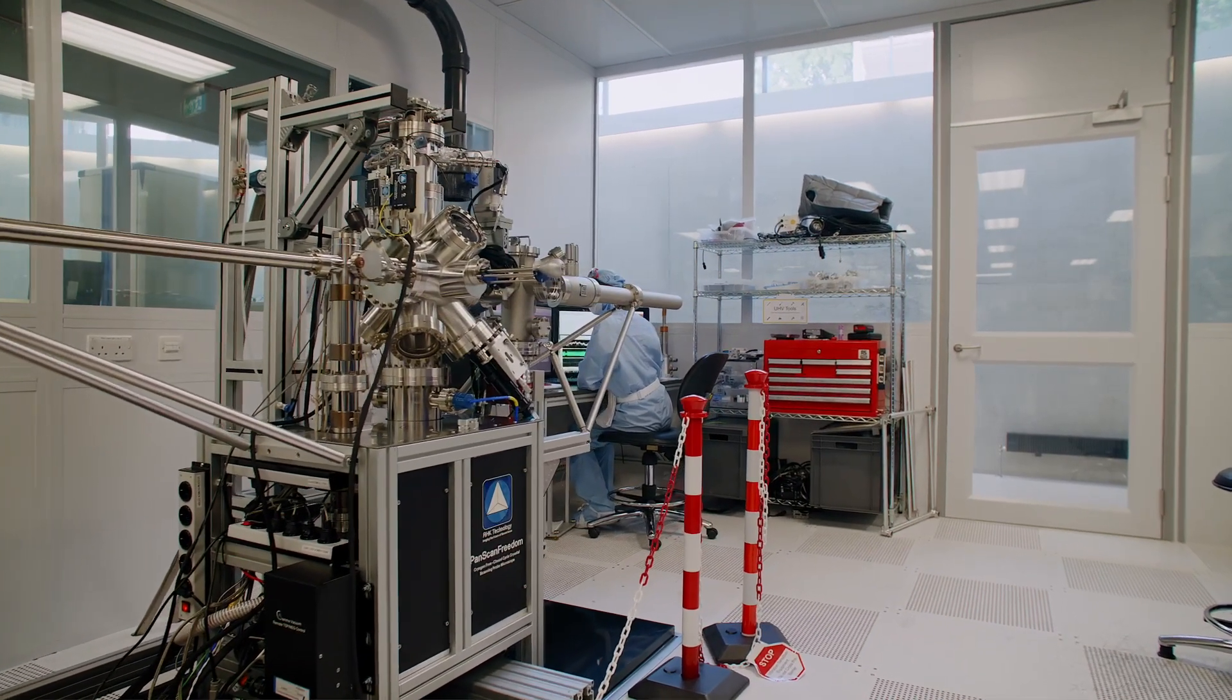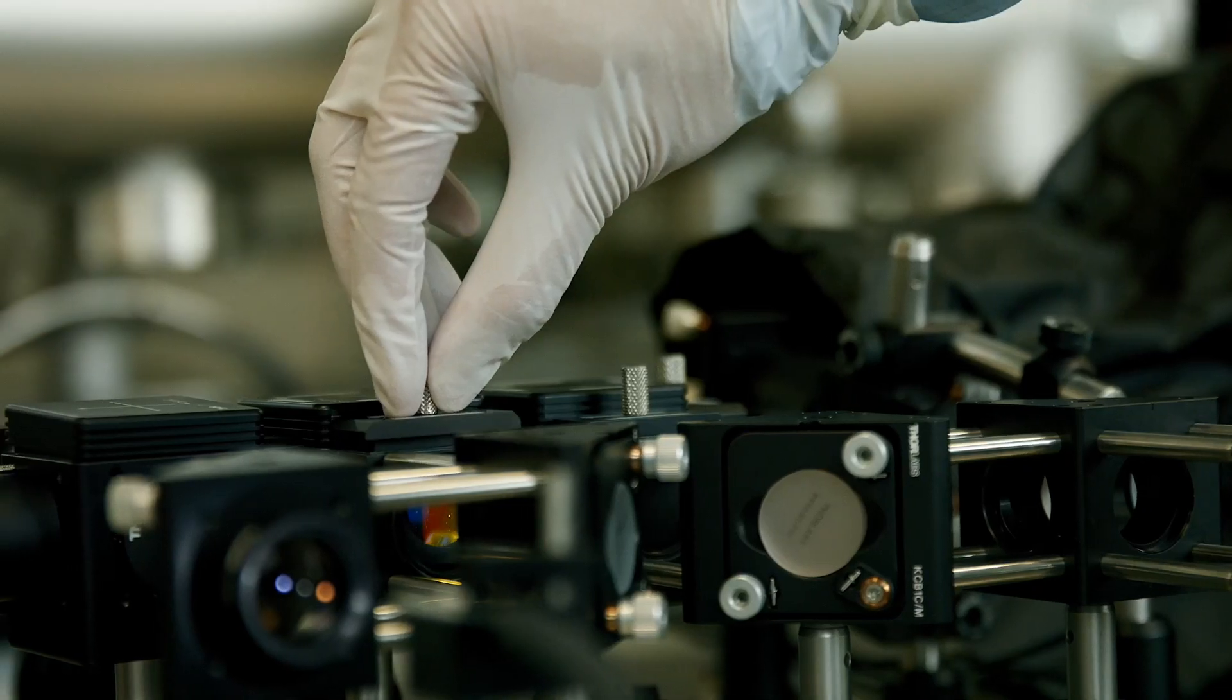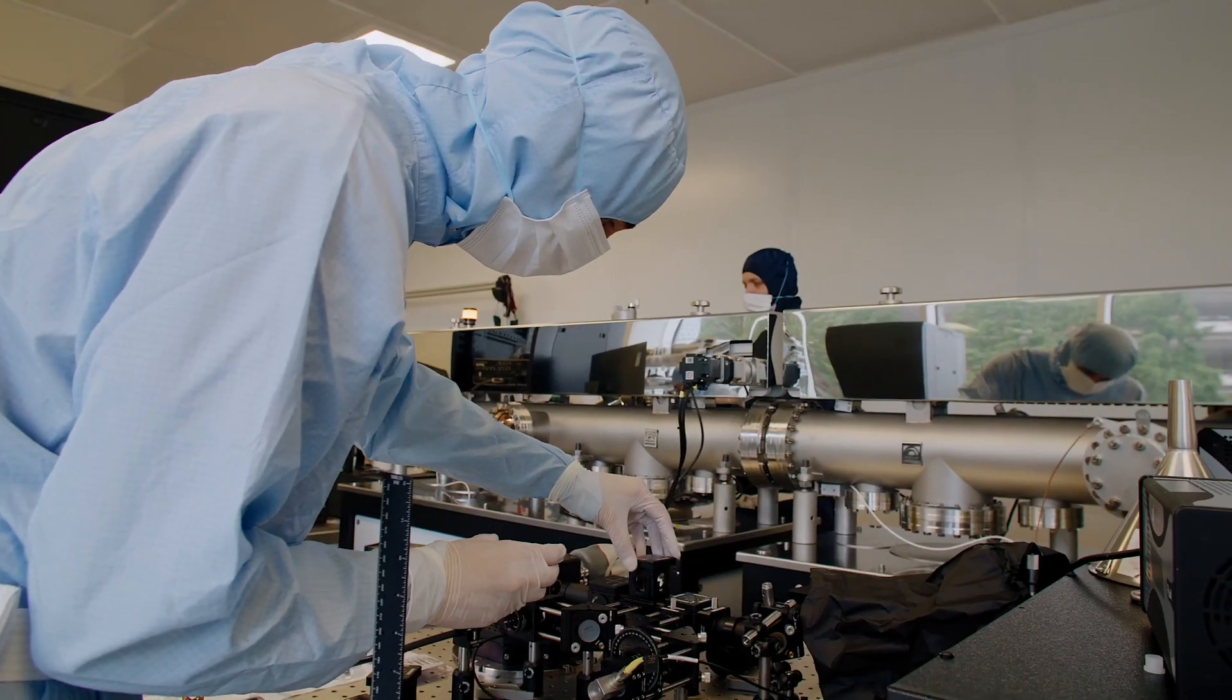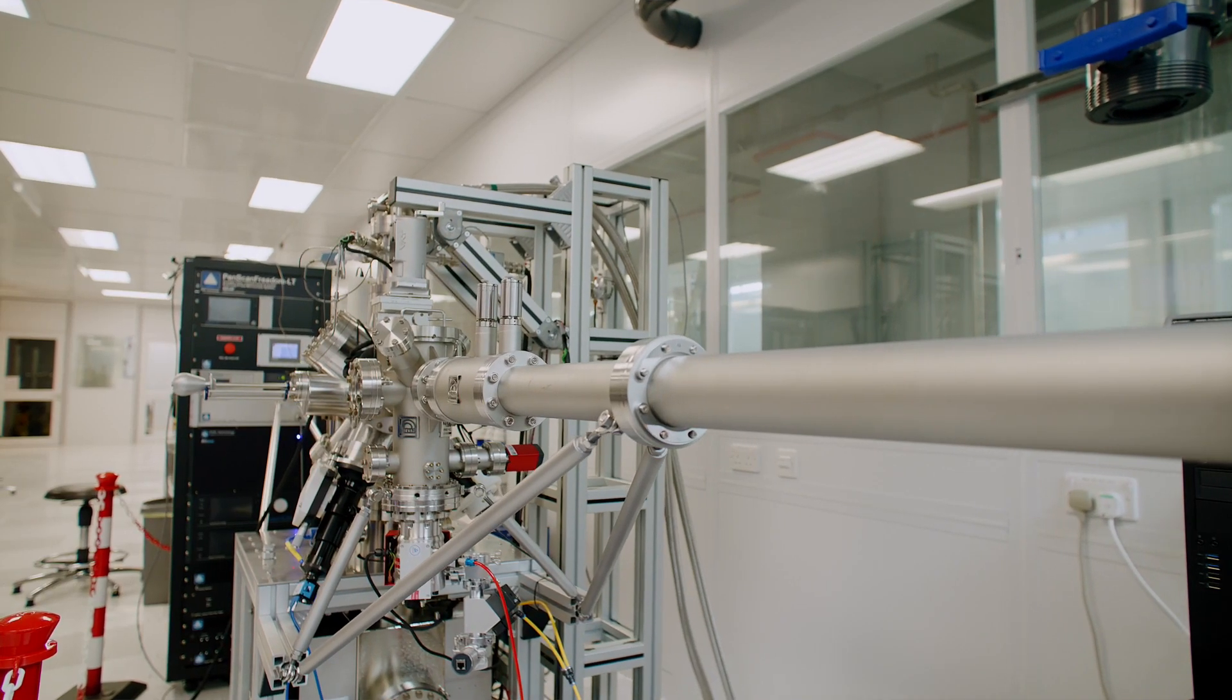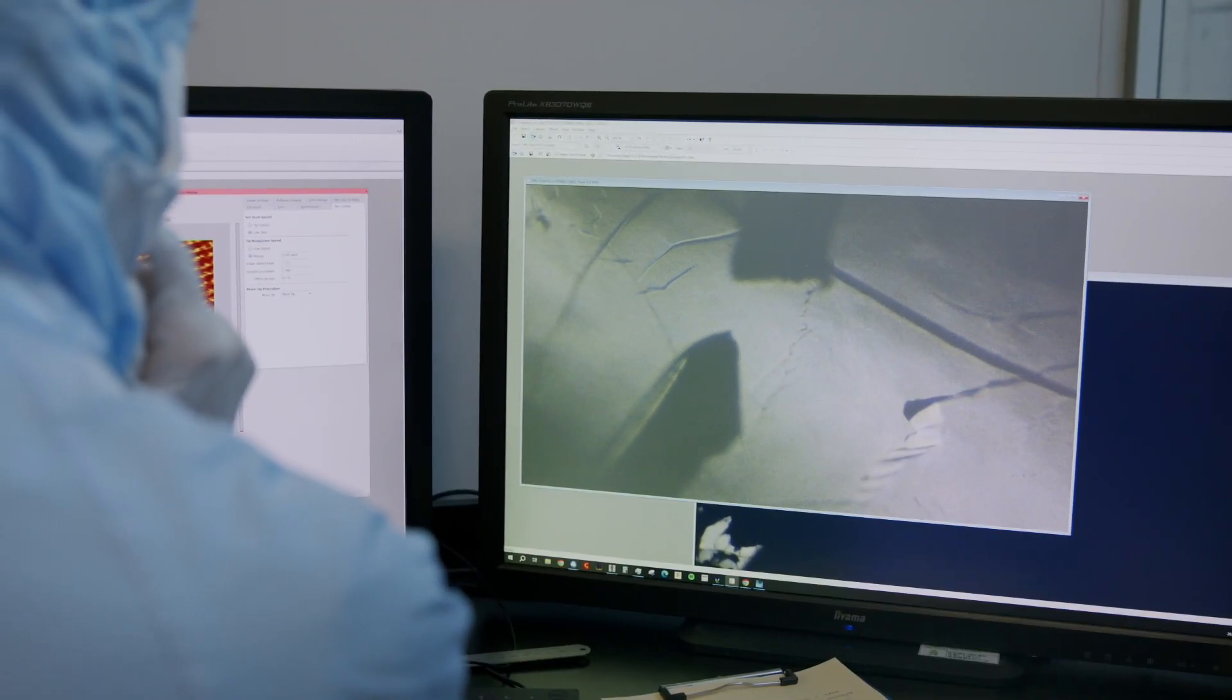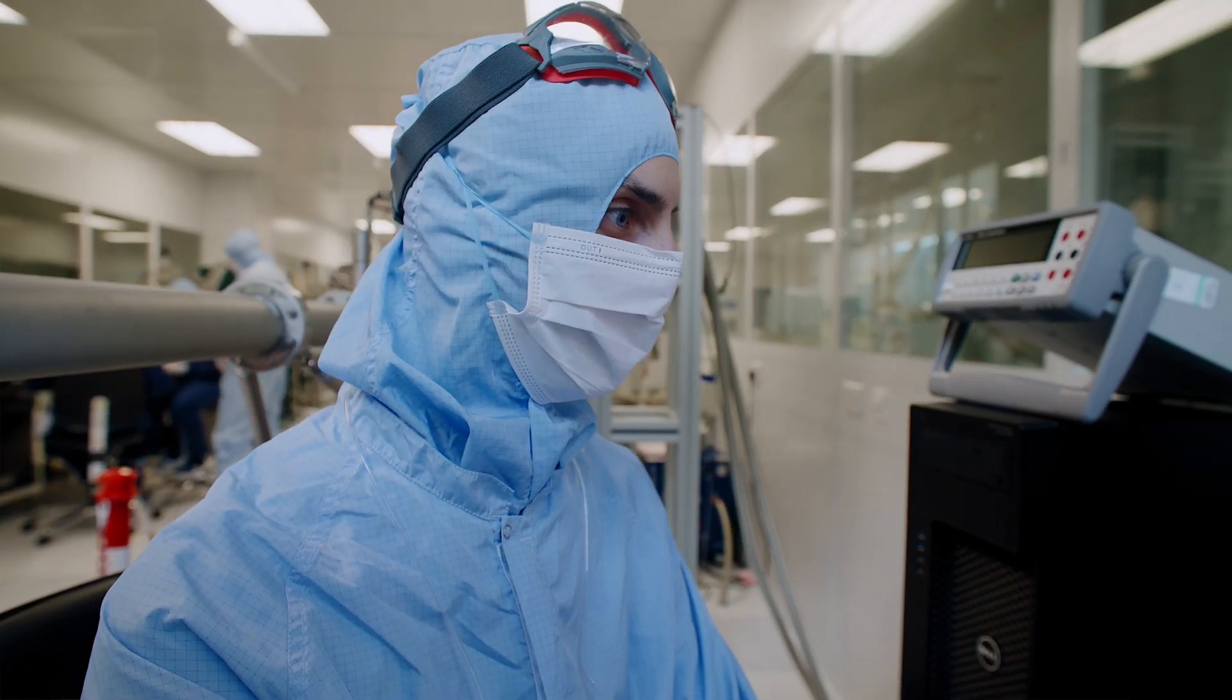The UHV system is coupled with a scanning tunneling microscope and a UHV optical setup, which means we can measure samples made in UHV without exposing them to ambient atmosphere. The UHV scanning tunneling microscope enables us to measure the actual electronic properties of the material locally, which is good because we want to study structural properties of the materials we make in UHV.